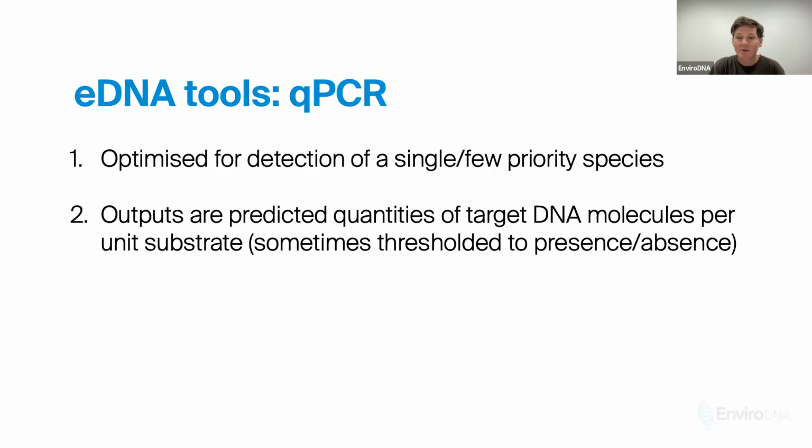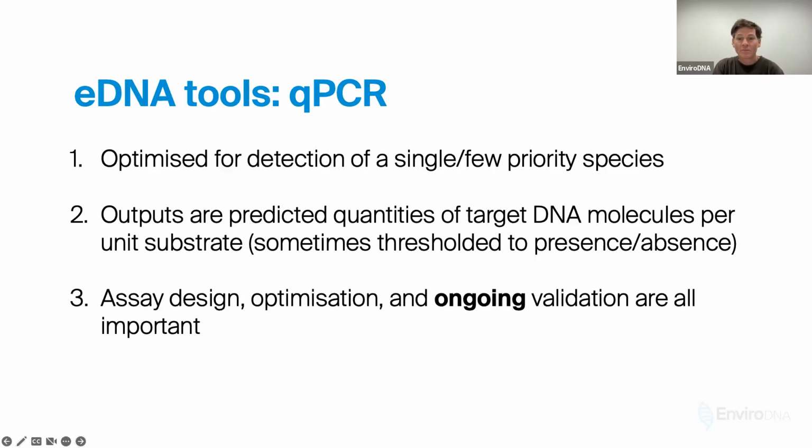We typically turn results around for routine assays in 1 to 2 weeks, and really less than 2 days of that is time spent actually in the lab. So there is room for improvement with us and other service providers in really shrinking that turnaround time. Assays can be made well or not so well, really, depending on the data and processes behind them. So I would like you to take that from this, if it's not already obvious to you, and their usefulness may change through time and space. And so ongoing validation is really important.